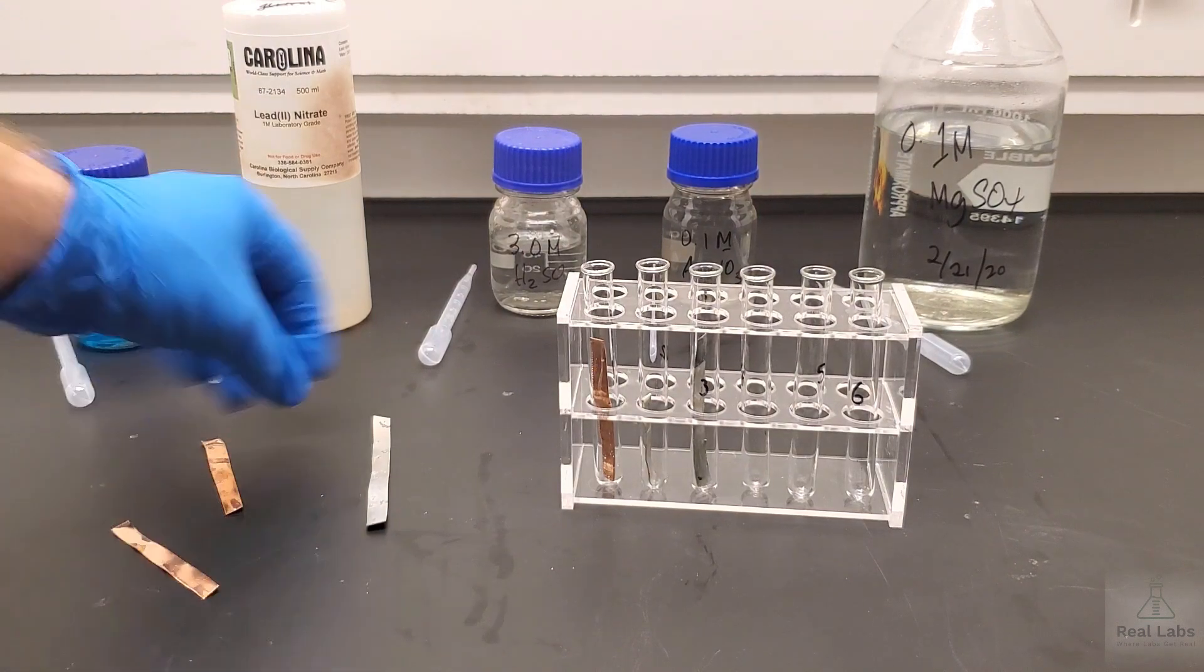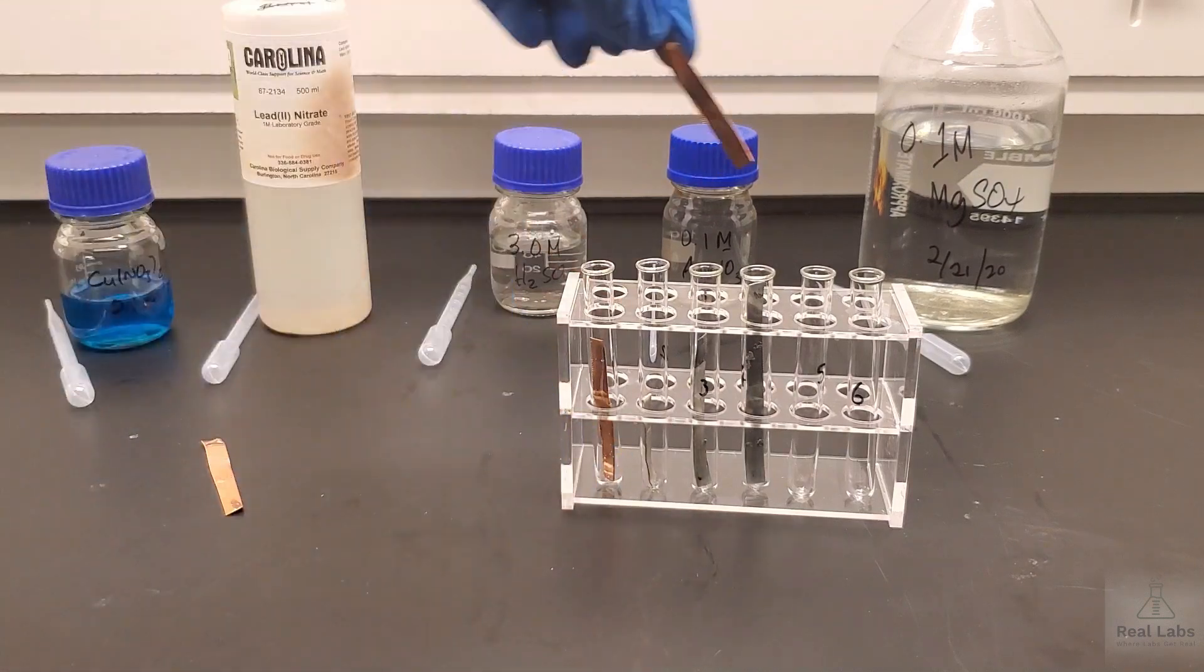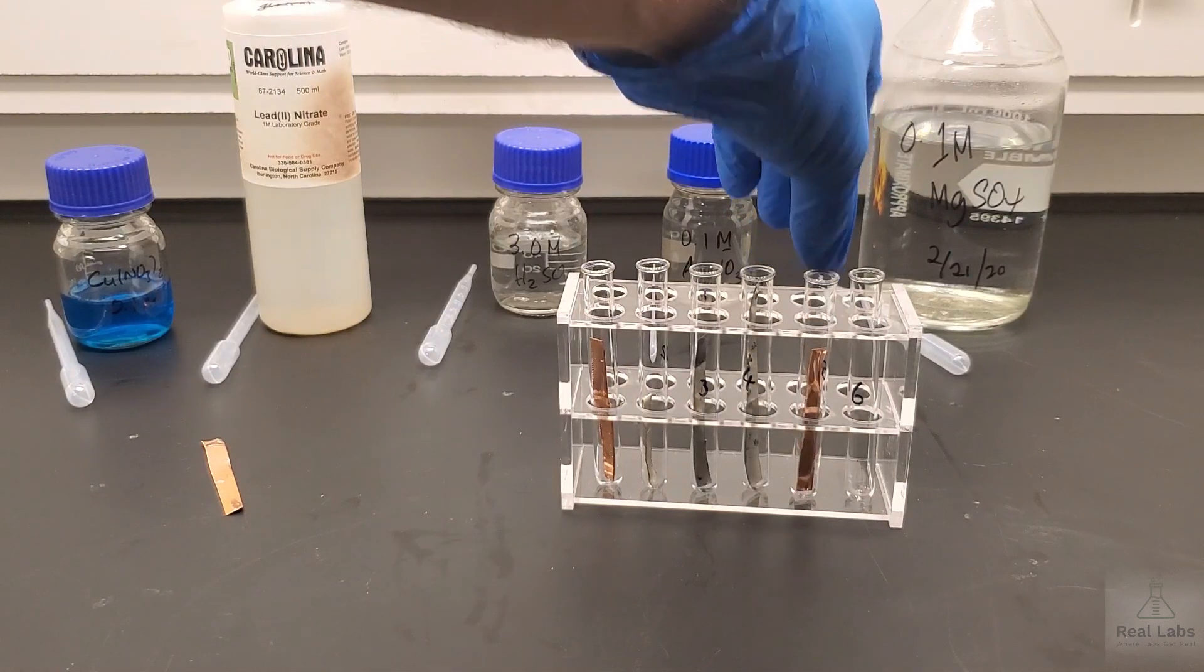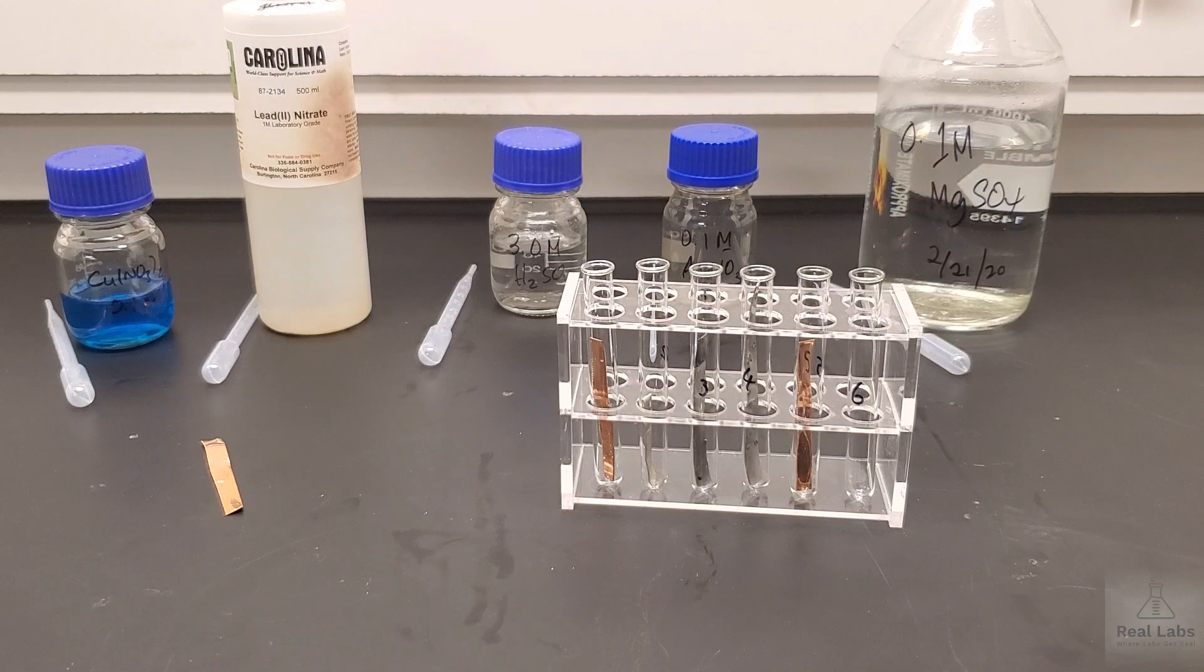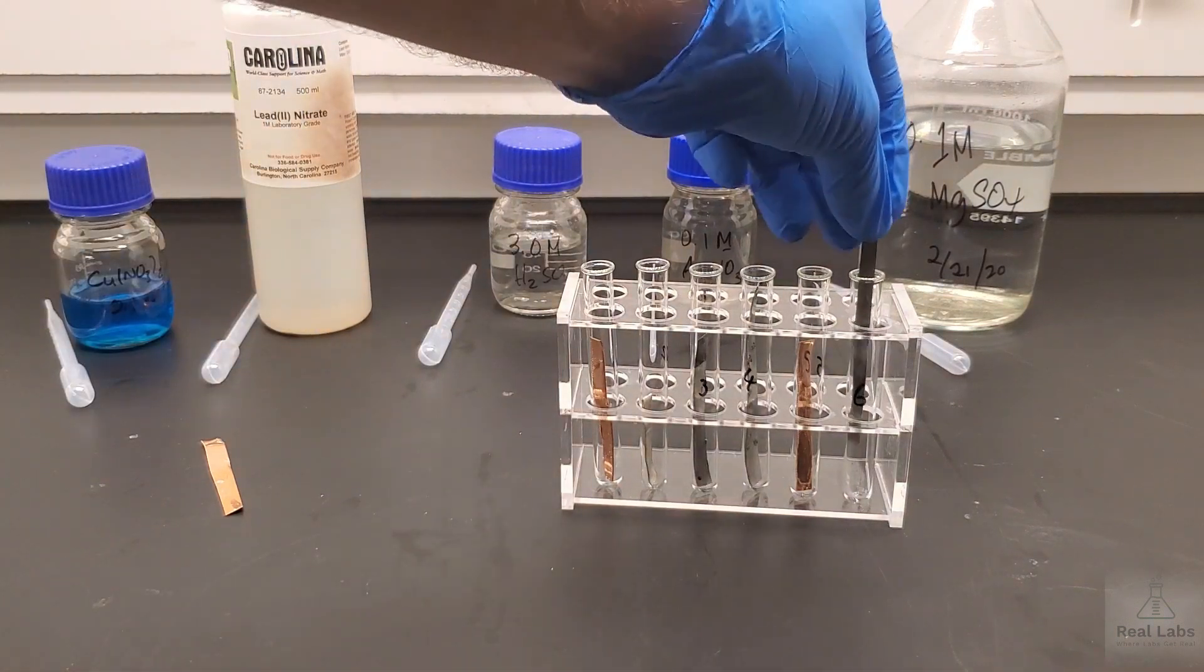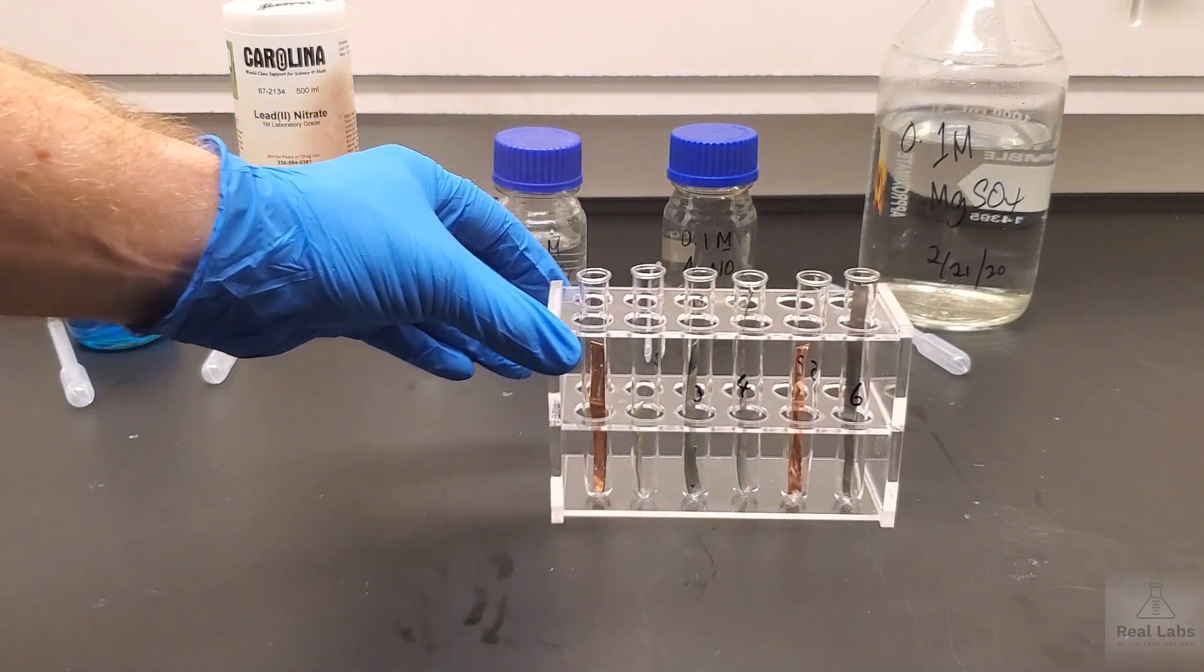We're going to put a zinc strip in number four. We're really going to be looking at the reactions down here in the lower third. Then we're going to put a copper strip in the fifth one. And I need one more zinc strip. So we've got a copper strip in the first one, a lead strip in the second one, a zinc strip in the third and the fourth, copper in the fifth and a zinc in the sixth.